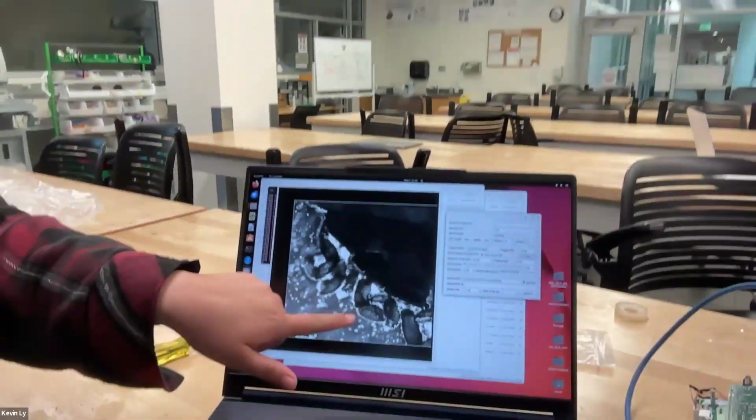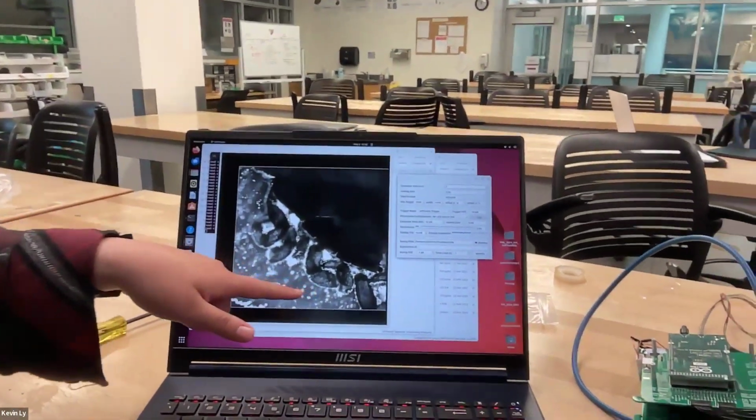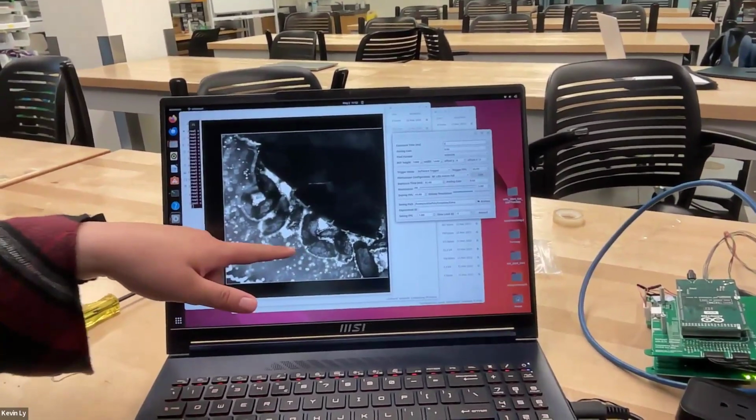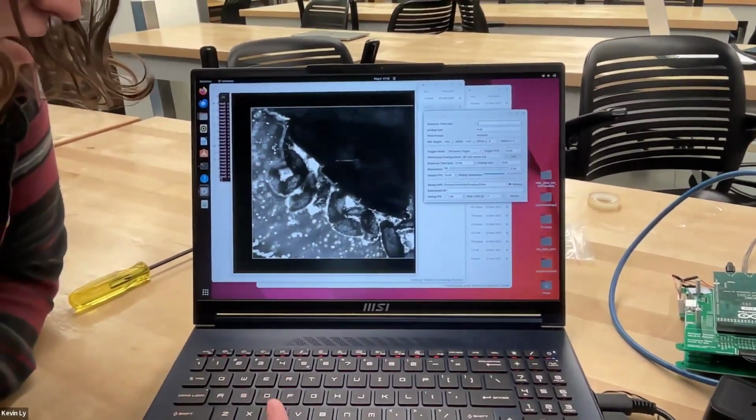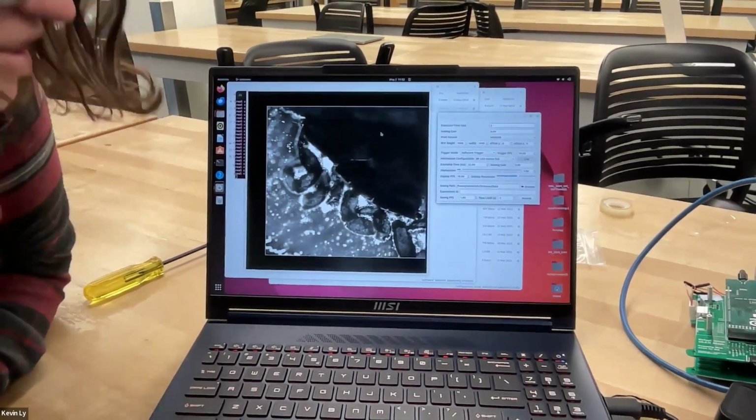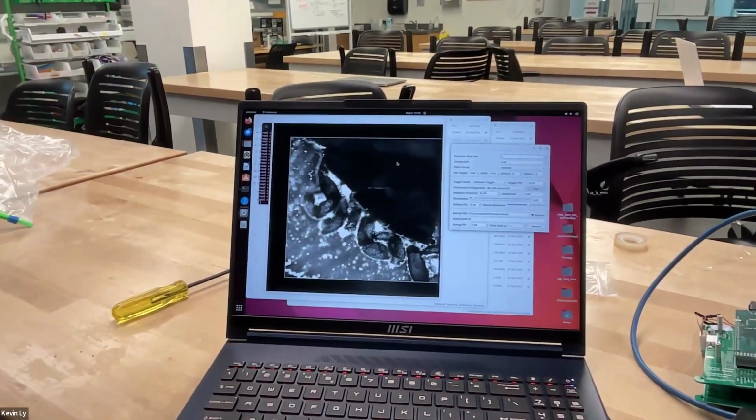Oh my gosh. So this is a tick that we just taped over where we couldn't find a slide. So these are each legs of the tick, and then this is its body right here. And I can move, I think X, Y is. Okay.